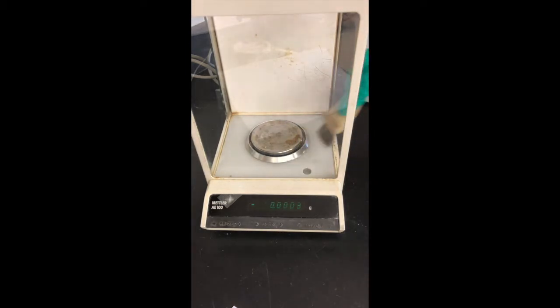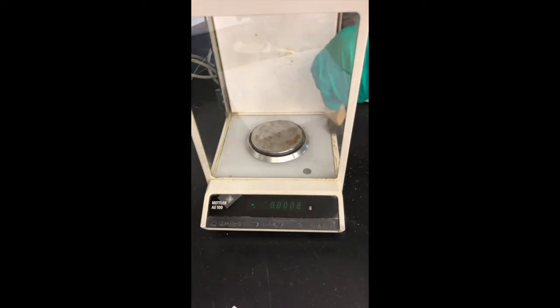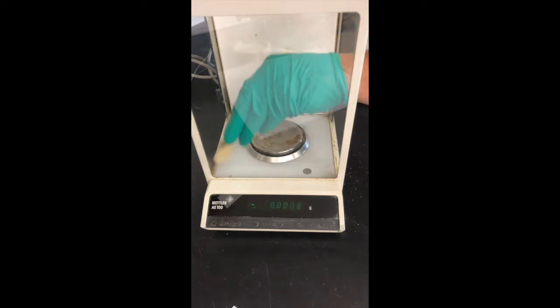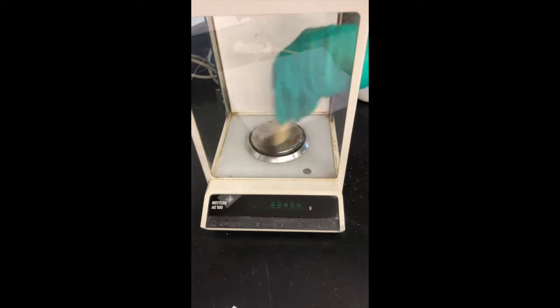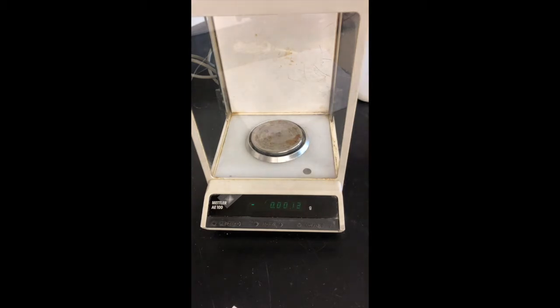Experiment A for the density lab, the preparation of a density rainbow. We're going to be using the analytical balance, and first thing to start, we're going to make sure that the balance is nice and clean, because in the future when we are working with chemicals, we're going to want to make sure that there's no contamination. So we'll be starting with the analytical balance, which we saw earlier in our videos.